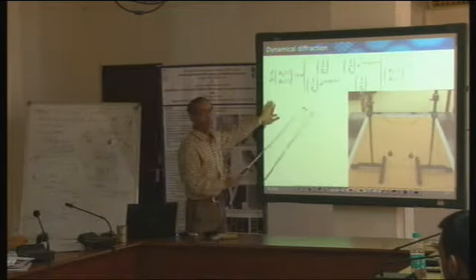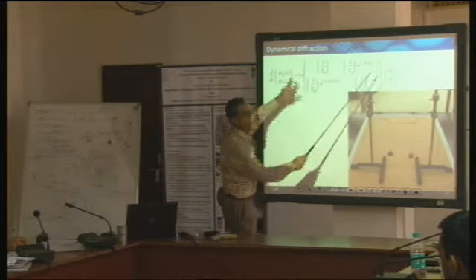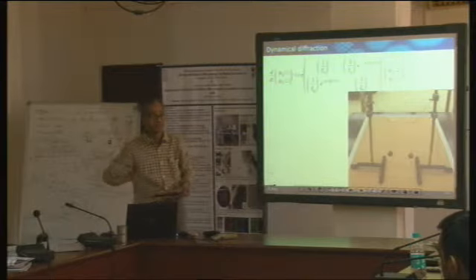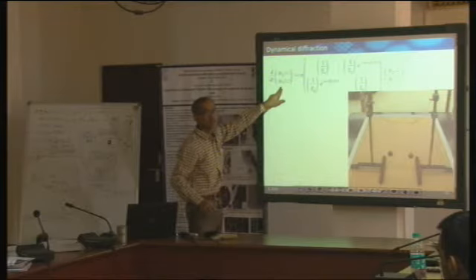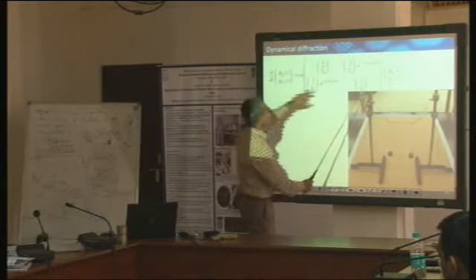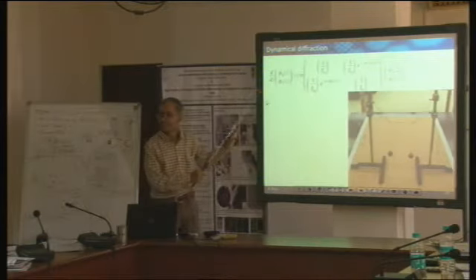So basically the meaning of this equation is that if I consider the diffracted beam, using this parameter there is dependence on the diffracted beam intensity at that point, but using this parameter it is also dependent upon the incident or zeroth beam intensity. The same holds for the non-diffracted or non-scattered beam. With this parameter, it depends not only on the zeroth beam intensity, but using this parameter it also depends on the diffracted beam intensity. So that's the meaning of that.